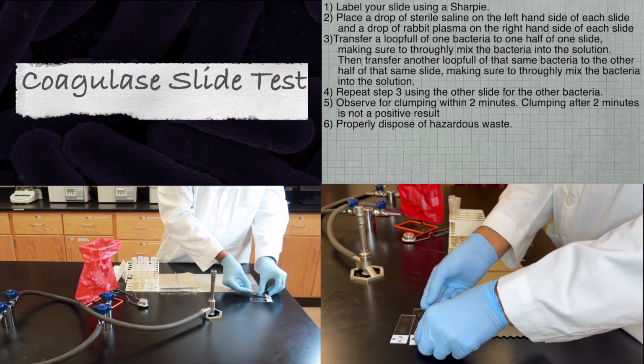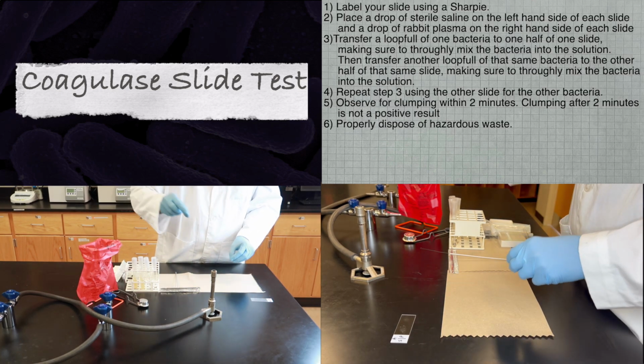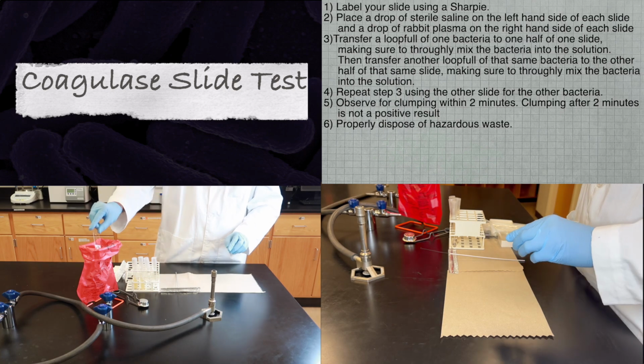Finally, please properly dispose of your slides and the bacteria cultures into the hazardous waste bag.